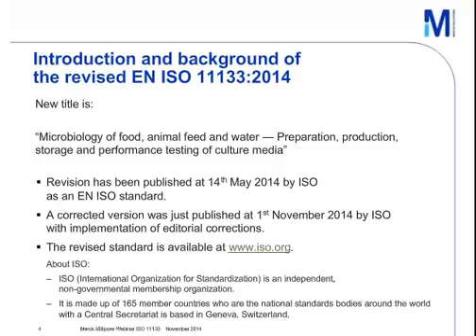The new title of the revised EN ISO 11133 from this year is Microbiology of Food, Animal Feed and Water. Preparation, production, storage and performance testing of culture media. The revision has just been published this year on 14th May by ISO as a full EN ISO standard. Just some days before, a corrected version was published on 1st November by ISO with implementation of editorial corrections. The revised standard is available at the ISO.org website, but also at your national standardization bodies around the world.